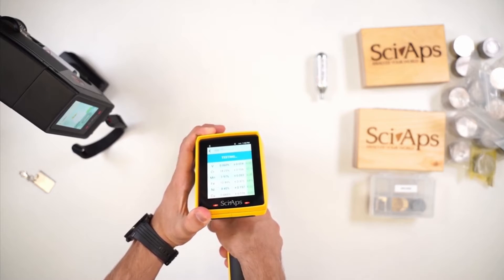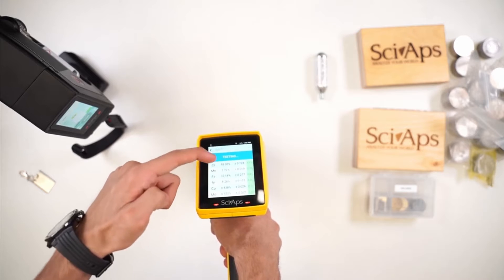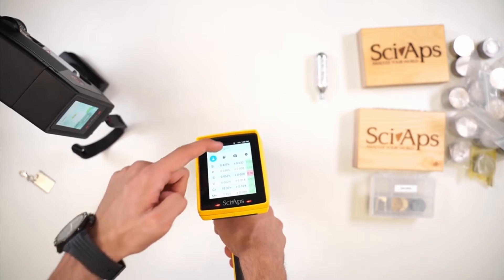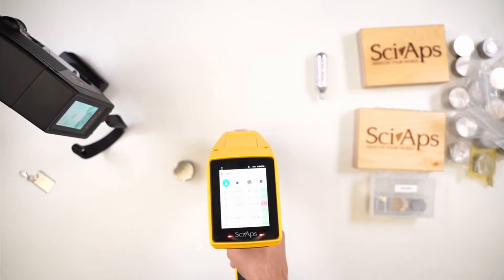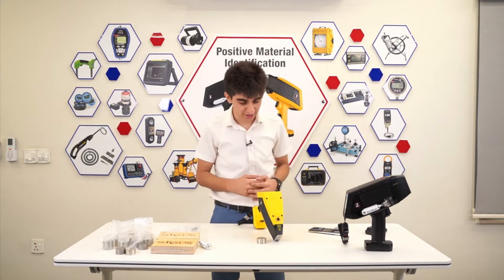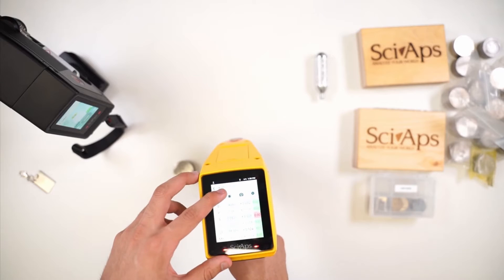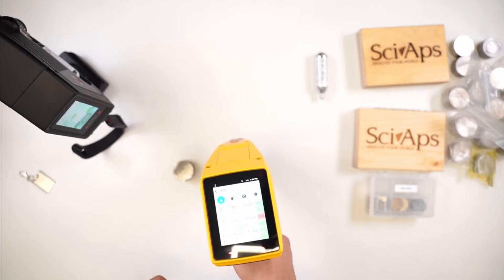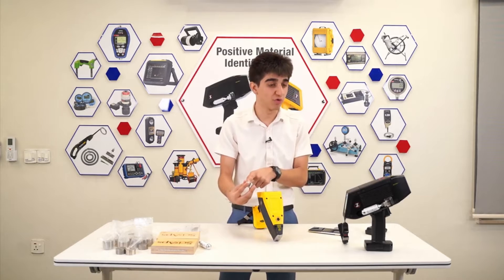You instantly get the chemical composition of all the elements. In addition to that, you get the grade match — you can see at the top we have a grade match: 304. The test is complete. You can view all the chemical composition and also the grade match. The unit has a pre-saved database which it compares the chemical composition to and identifies the grade for you. Here, we identified 304 at a 98% match — and the test was done on a 304 test block.